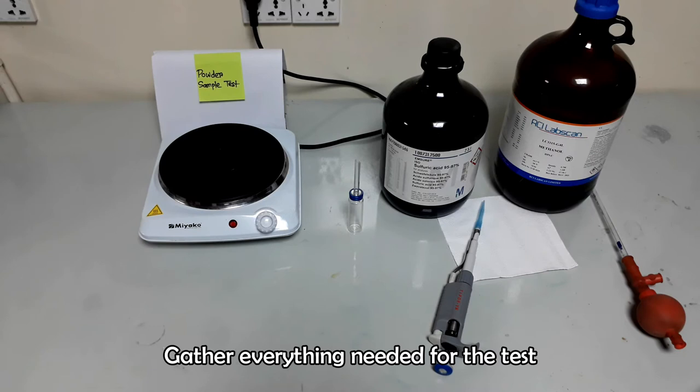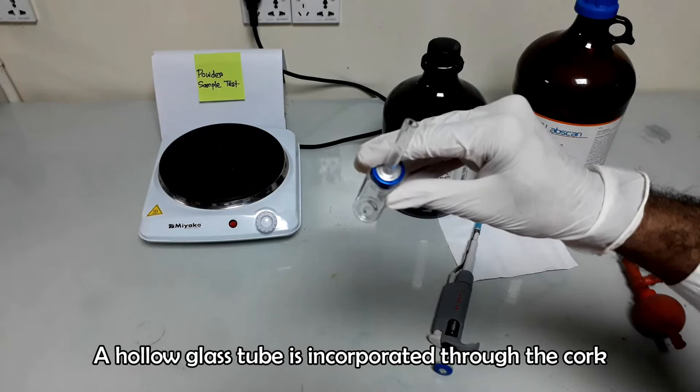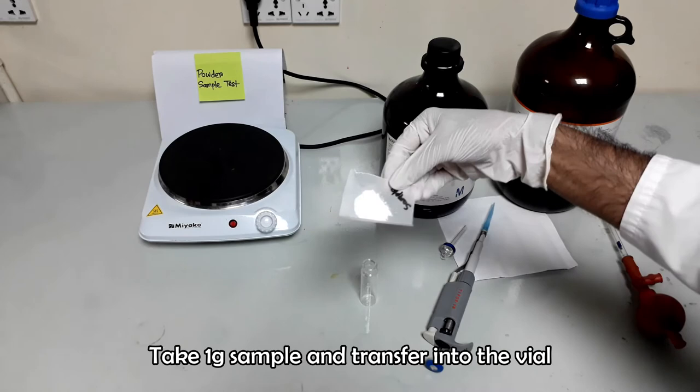Sample preparation is quite easy for this test. You can see this is a glass vial. A cork with long hollow tube is attached with it. Take 1 gram sample into a glass vial.